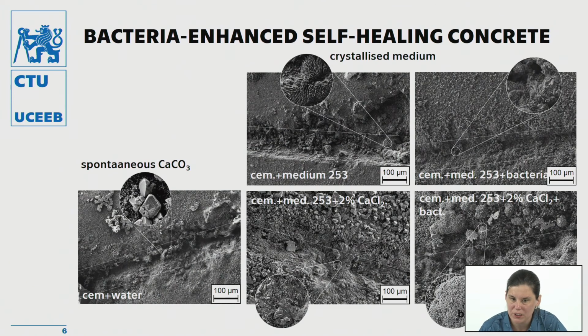Again, I will show you the pictures, and you can see several pictures. This one is a picture where no bacteria and no bacteria supporting medium was used, just simple water during the preparation of the cement paste.